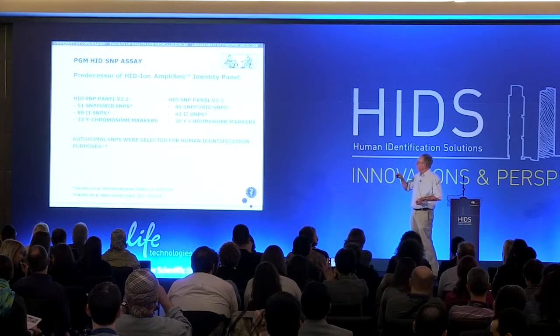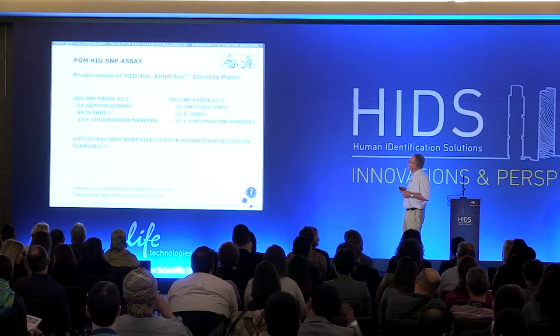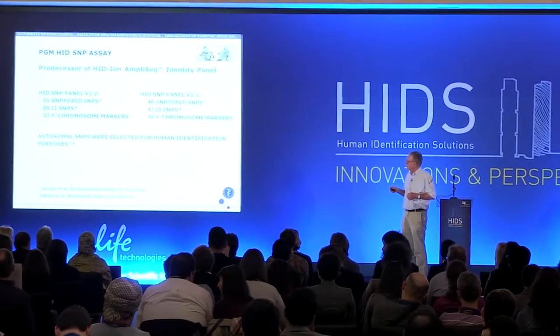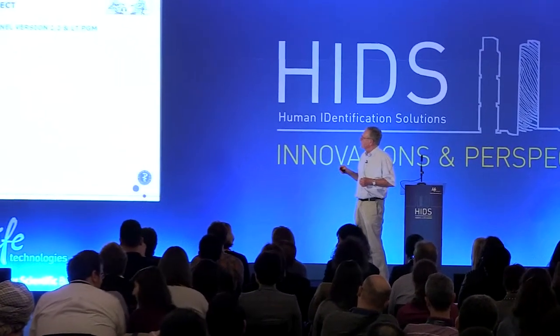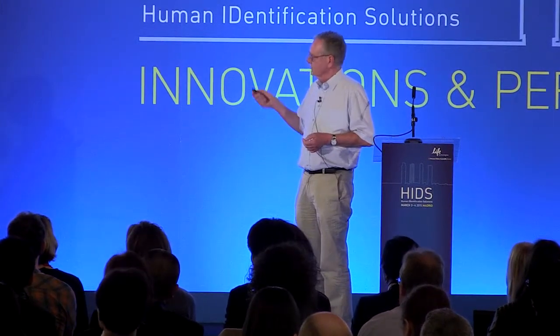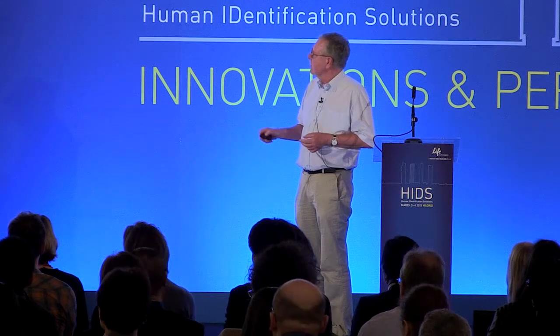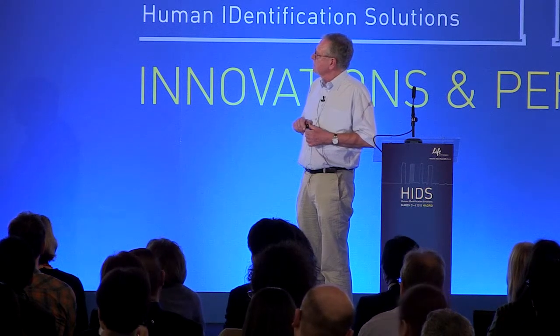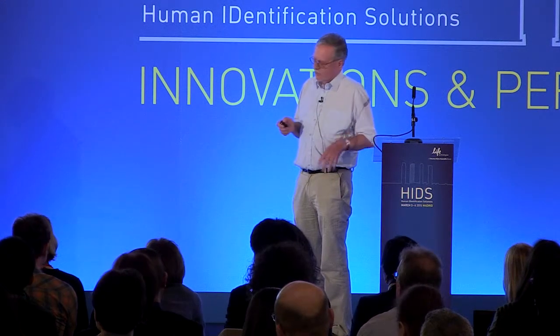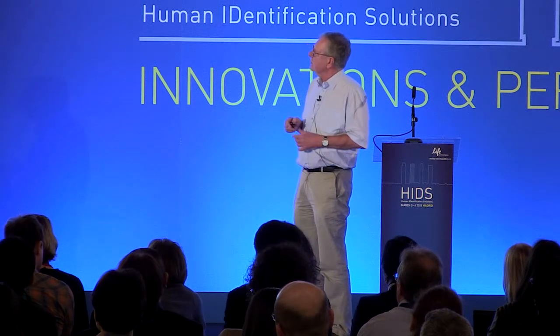And we have published work on some of these packages from Applied Biosystems, and you can see it here. A package with 160 SNPs, and you can read it in Forensic Science International: Genetics. Here you see some images of the coverage and with allele balances, and the results were concordant with the previously obtained results.